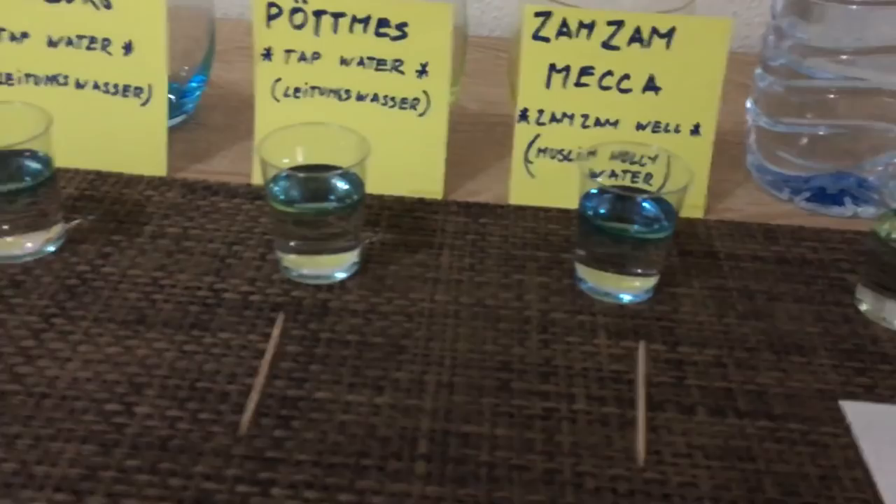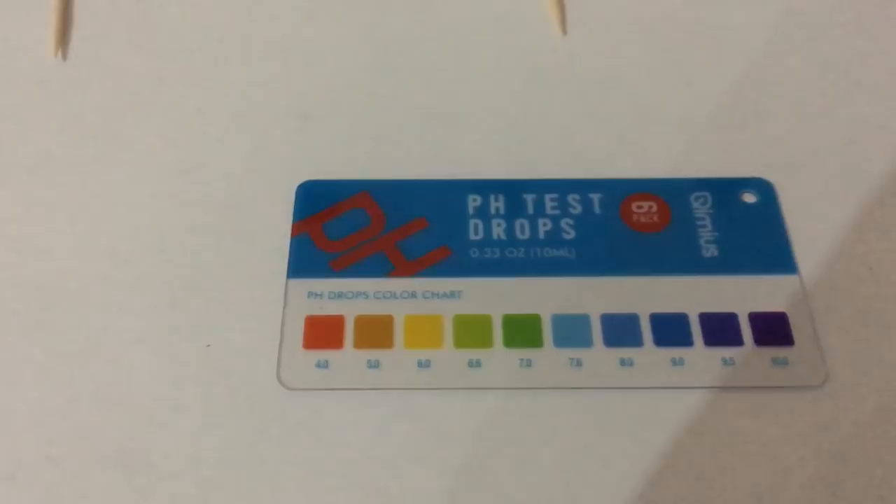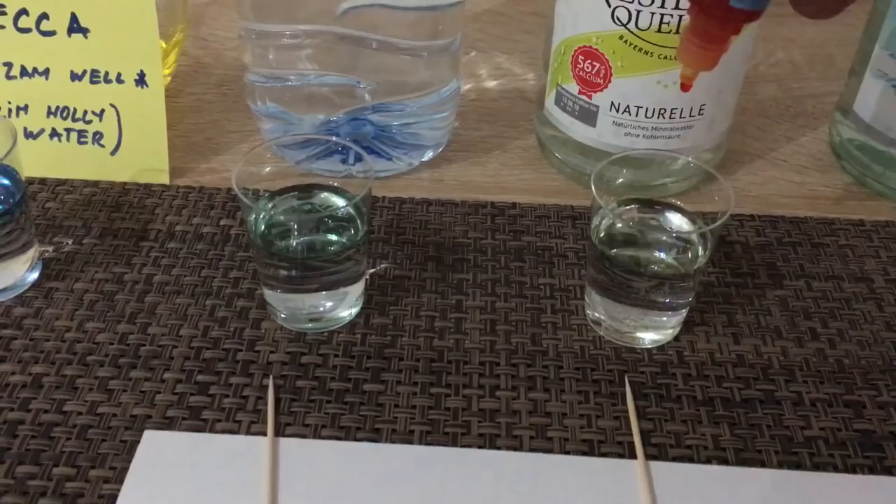As we can see, everything is turning pretty much this beautiful blue. But Walvik is a bit greenish, and if we look at the level here, that's not too bad compared to the other ones — but a bit disappointing.